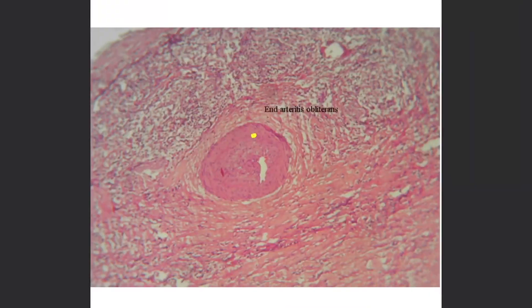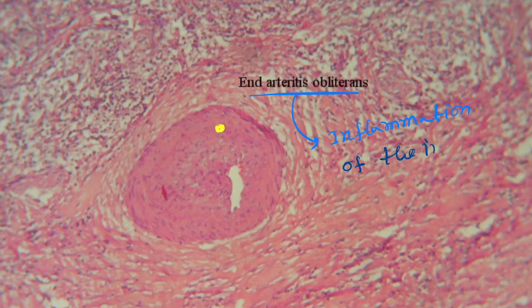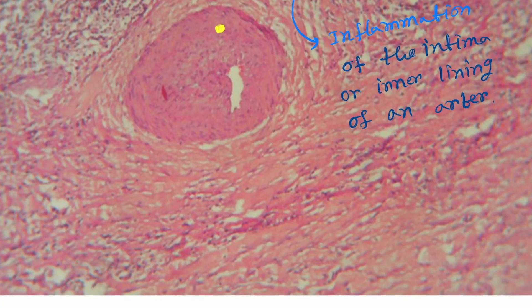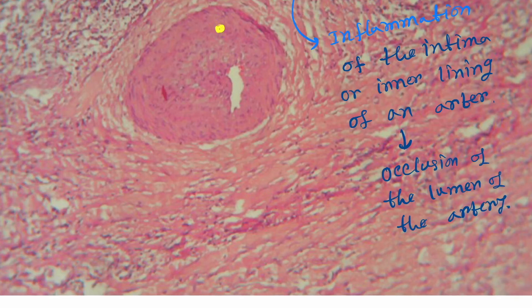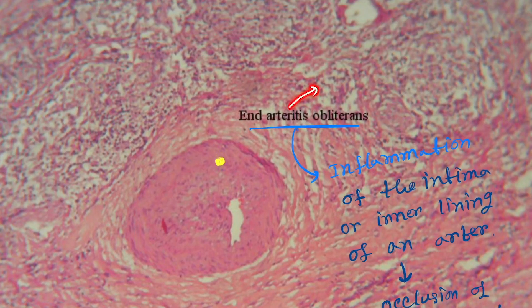Also lymphocytes are present as inflammatory cells. The most important feature is endarteritis obliterans — this means inflammation of the intima, or inner lining, of an artery, which causes occlusion of the lumen of the artery. Here you can see endarteritis obliterans — this is the most important feature.